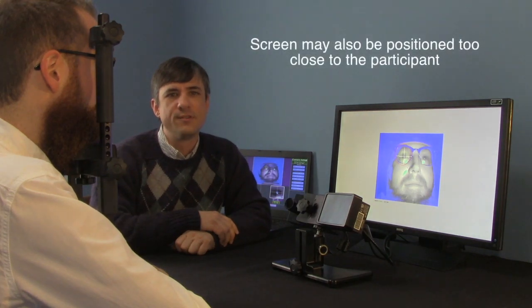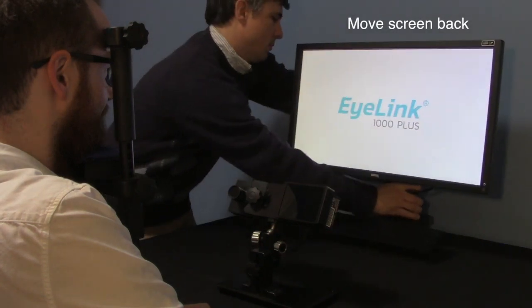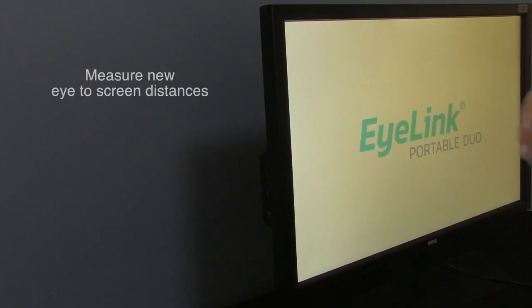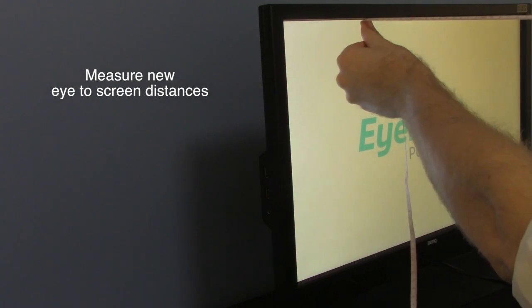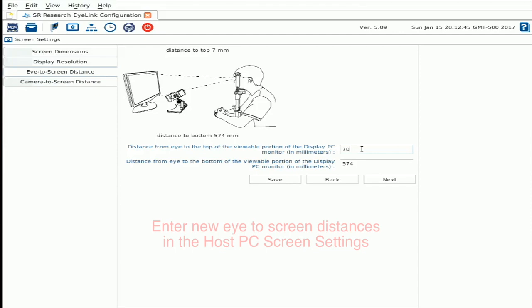If that still doesn't solve the problem, your screen may be positioned too close to the participant, so the corners of the screen are outside the trackable range. You can move the screen further back, then measure the new eye-to-screen distances and enter them into the screen settings page on the host PC. See the tracker installation videos for more information about the proper setup.